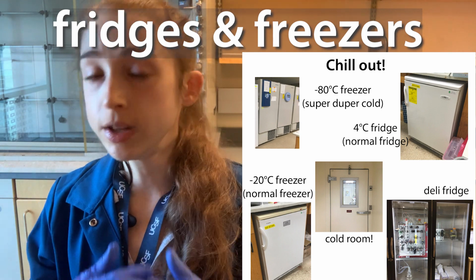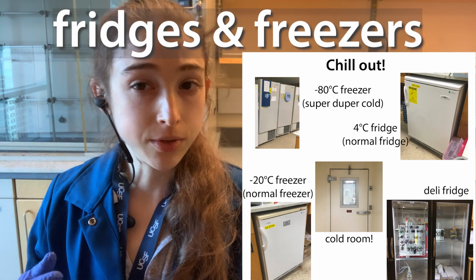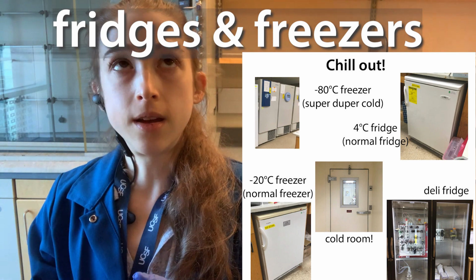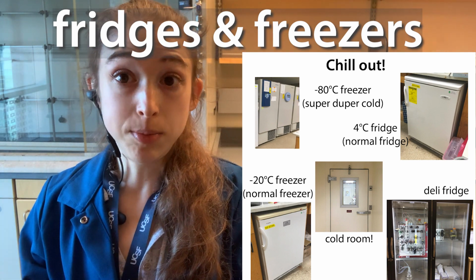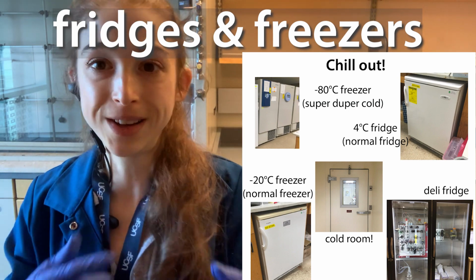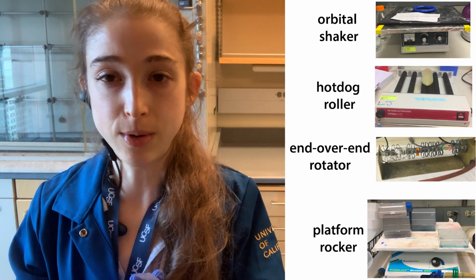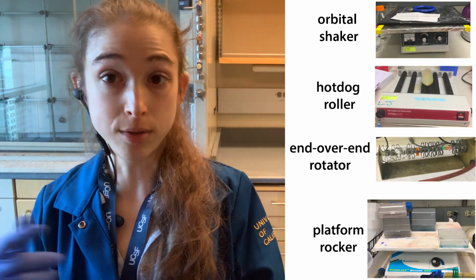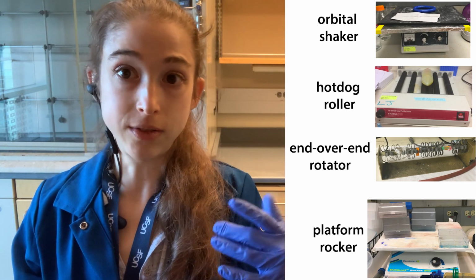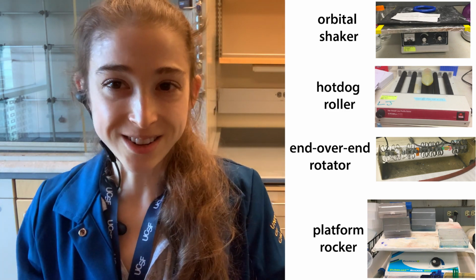Really, really cold, really, really hate working in it, but it's really great if you're doing like a gravity flow purification, something where things need to be cold and you need to be able to work with them. And it's also really useful if you need to do things that need shaking or like nutating or rolling or stuff like that. So there are various ways in which we can keep samples agitated while we are working. So we talked about how the thermal shakers can shake things. When we're trying to do things cold, we can stick them in the cold room, but we have to put some sort of shaker on them, under them, or them in a shaker or something.